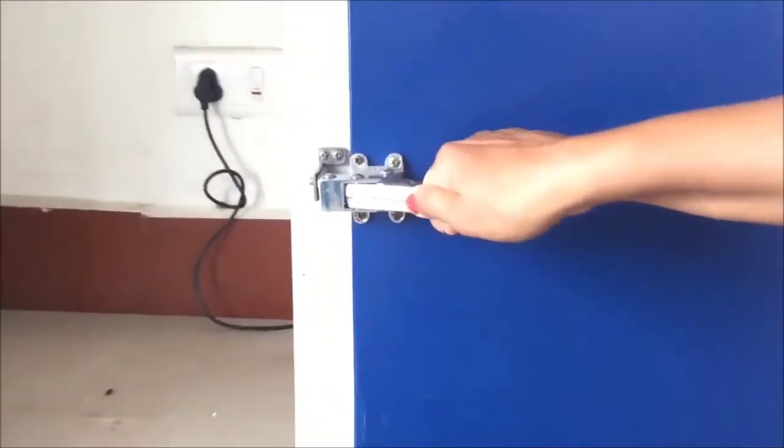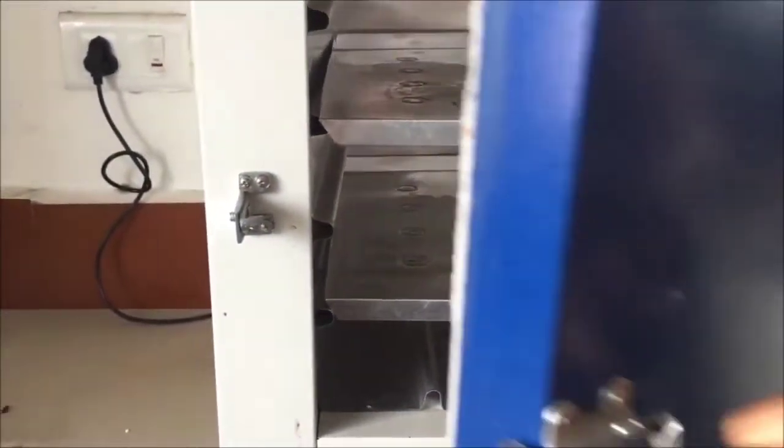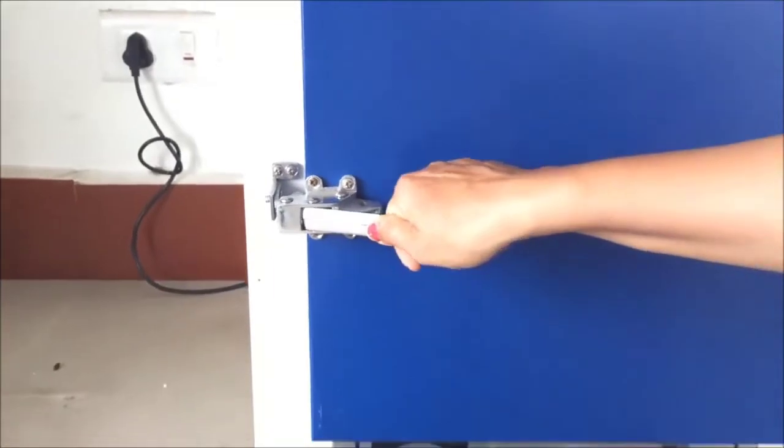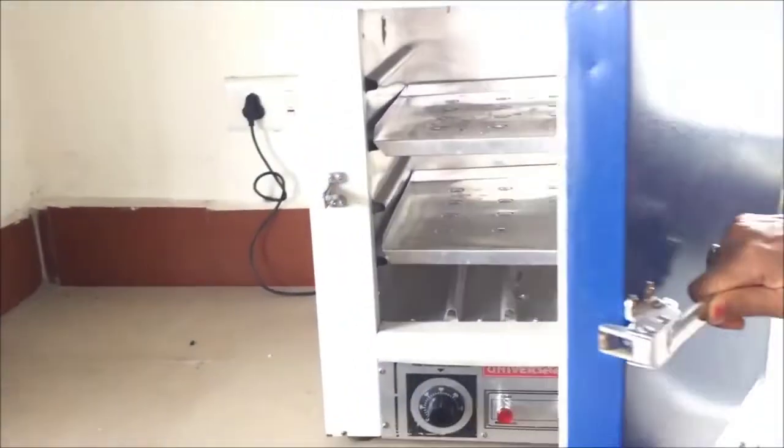The next part is the handle. It is a specialized handle which locks in a unidirectional way — it locks easily and opens easily, but it does not allow the loss of heat.